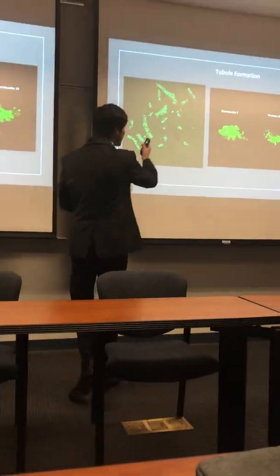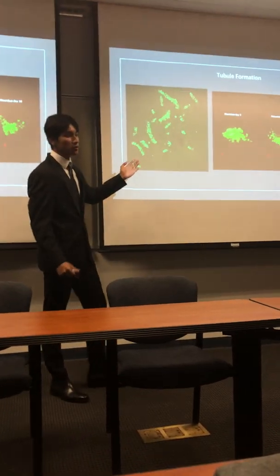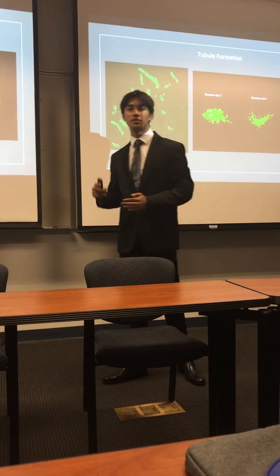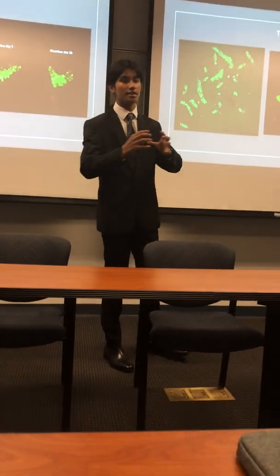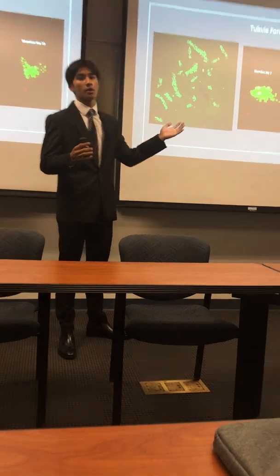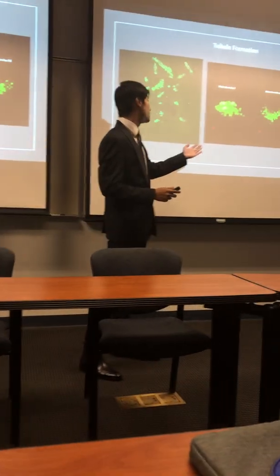This image here shows what was once a rhombus but got split into fragments. We believe this fragmentation was caused through our actin and nucleus staining, and with that, bubbles formed on the side of our wells, and when these bubbles expanded and they ruptured, it caused fragmentation of our rhombus design. Although this happened, this did not stop us from being able to image.